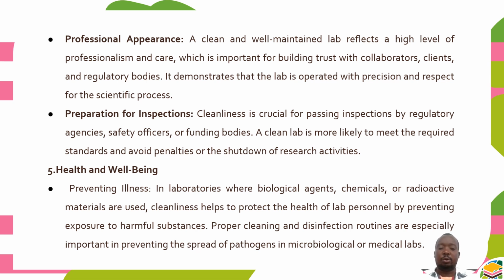Cleanliness is crucial for passing inspections by regulatory agencies, safety officers, or funding bodies. A clean lab is more likely to meet the required standards and avoid penalties or the shutdown of research activities.